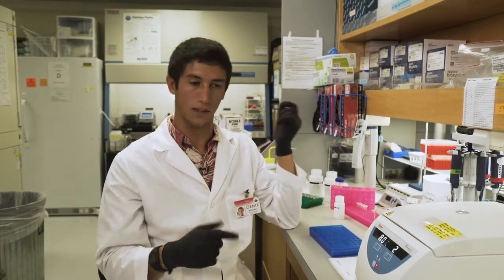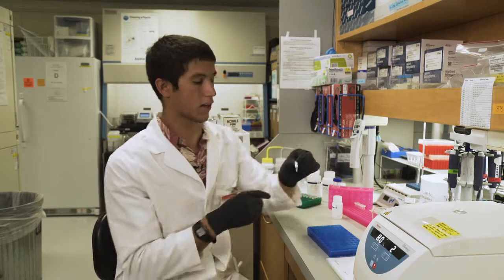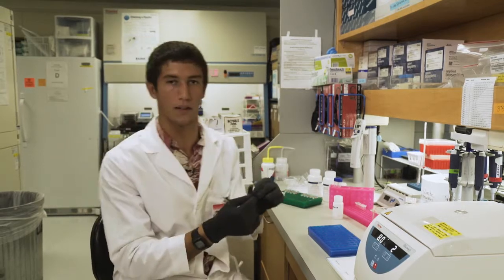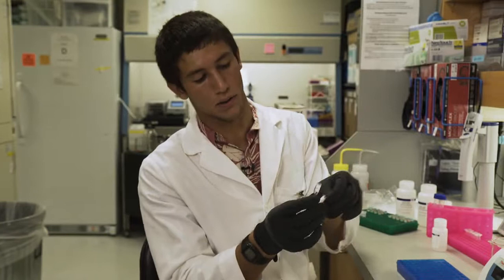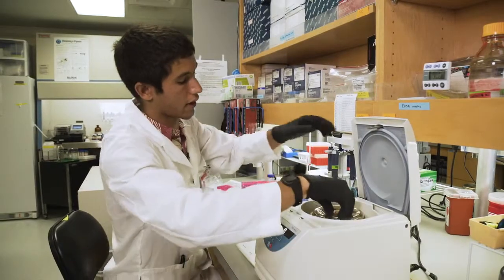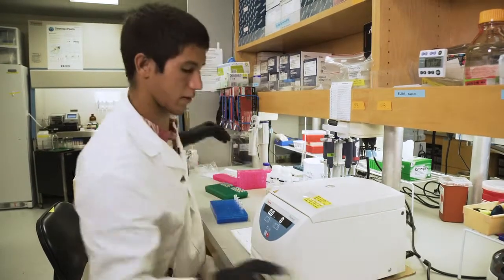So the top part will get tossed now, and we'll be keeping the bottom, and we'll be aliquoting the bottom into these little tubes for longer term storage. Usually when we do this, we split our sample when it's done into multiple tubes. So it's got the same number, but just a different letter. That's just, if anything happens to this tube, we still have the second one archived. All right, all done with this guy. We can close it and turn it off.